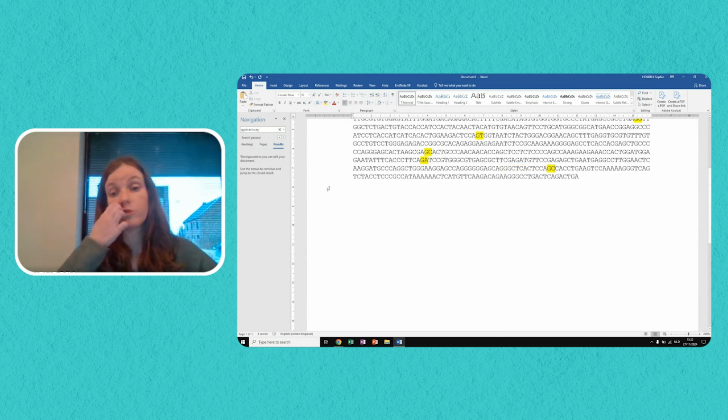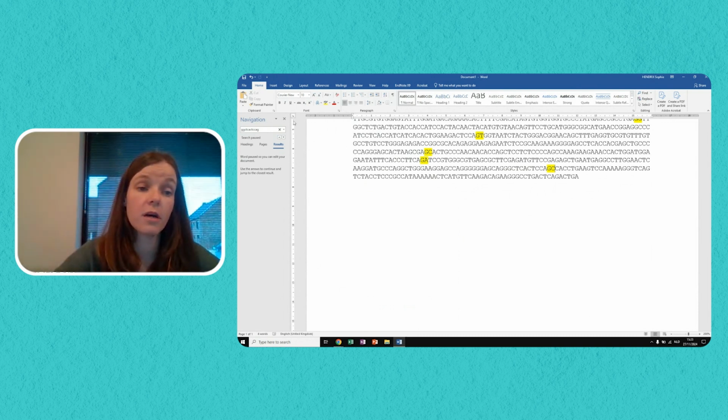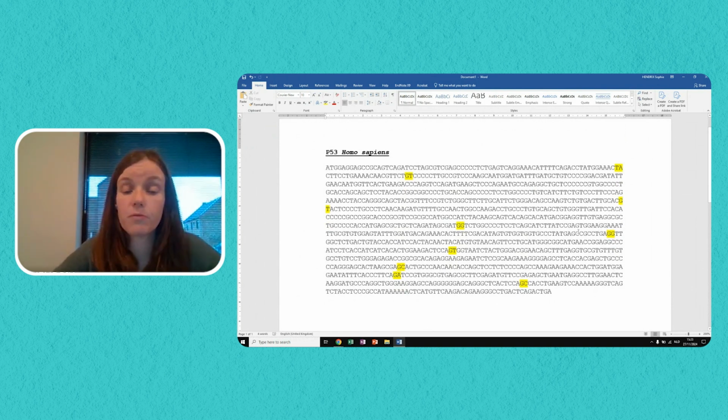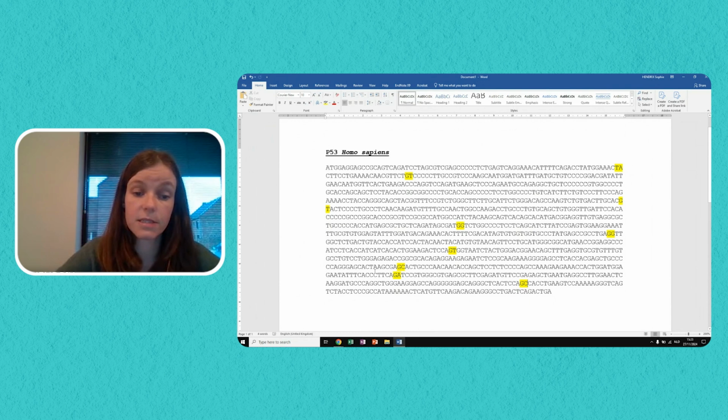And then exon number 11, we will not be able to find completely in this coding sequence because the last part of that exon is in the untranslated region. So therefore, we have now found all the exon-exon boundaries within the coding sequence. We can count them. So there is 1, 2, 3, 4, 5, 6, 7, 8, 9 exon-exon boundaries. So then I will add a title called exon-exon boundaries.